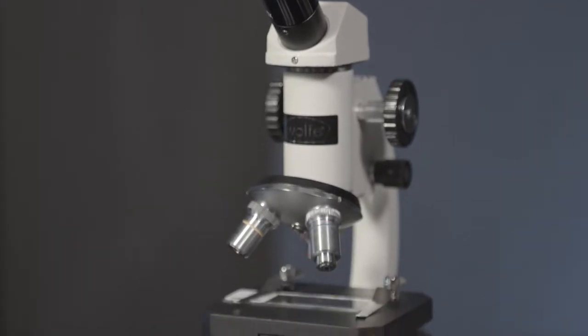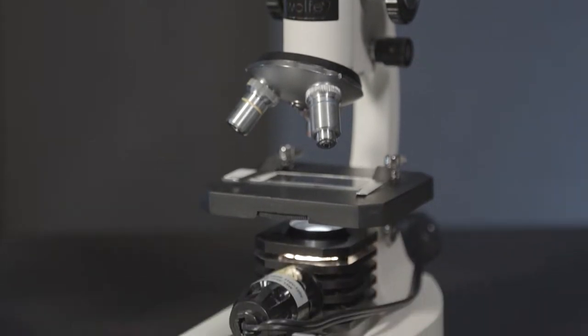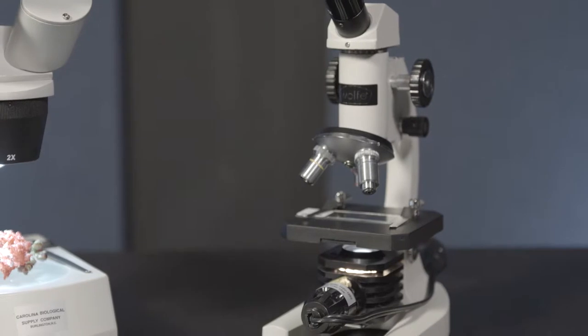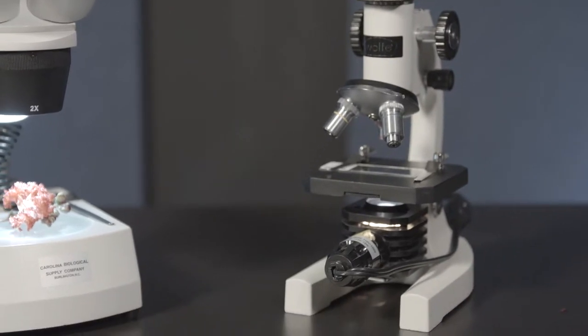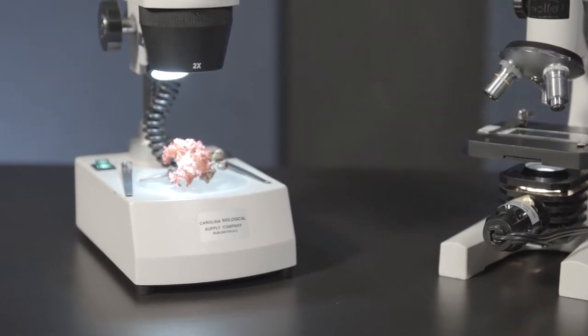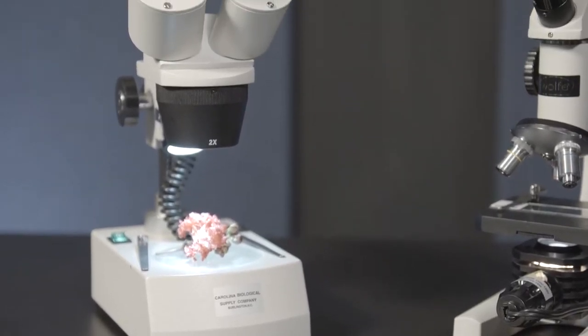Compound microscopes provide higher levels of magnification and are used for viewing micro-sized specimens that are thin enough to allow light to pass through them. These include microorganisms, thin slices of tissue samples, and cell structures.